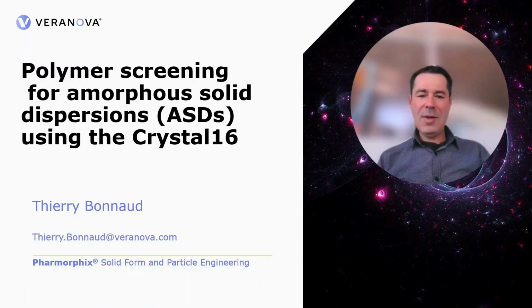Hi, my name is Thierry Bonnaud, and today I'm going to talk about polymer screening for amorphous solid dispersions, and this is using the Crystal16.